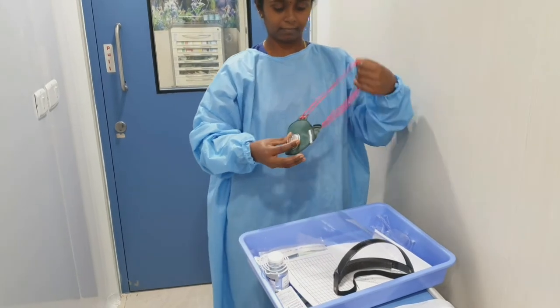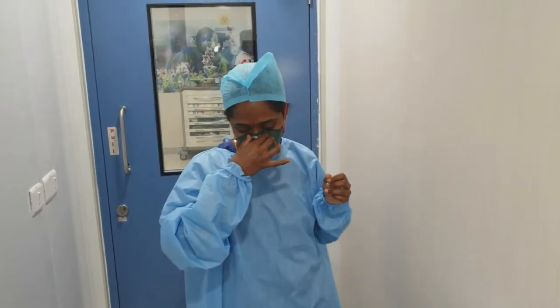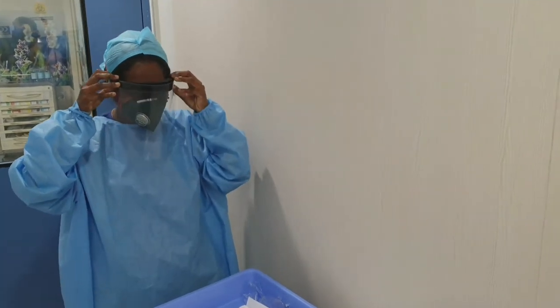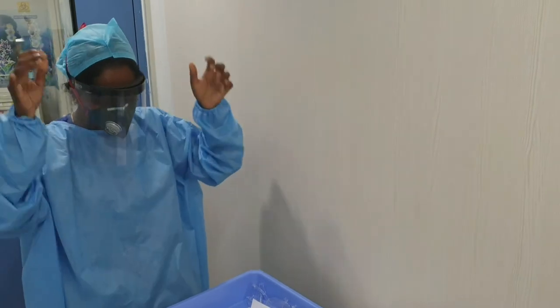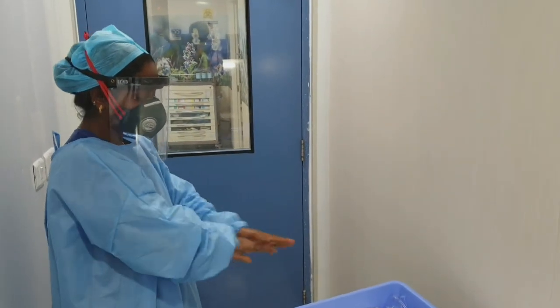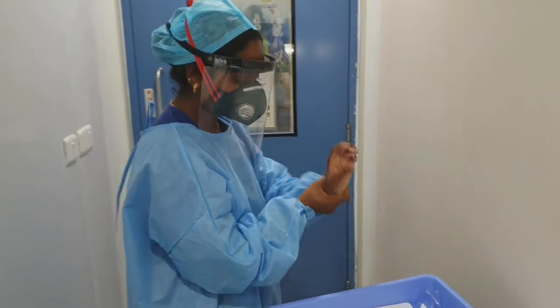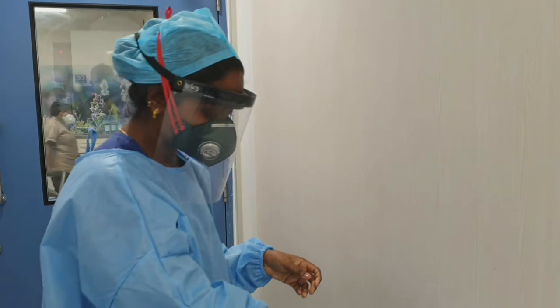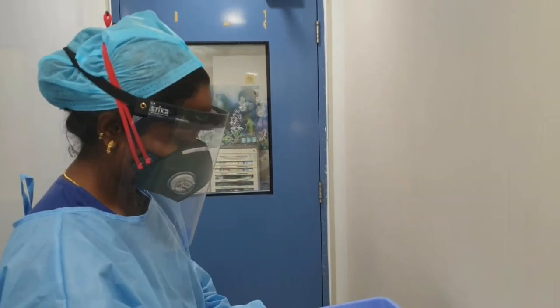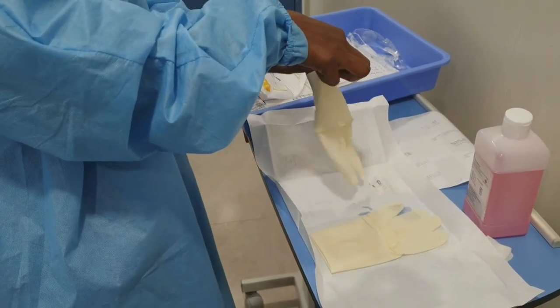This is an N95 respirator mask which is protecting any smaller aerosols from entering into the nostrils. This is an eye shield which helps protecting our face from any spillage of the hazardous drug or chemotherapy. Sterilizing your hand after finishing wearing your PPE. The alternate for eye shield is goggles, which could also be used when an eye shield is not available. She is wearing the first pair of gloves — there will be two pairs of sterile gloves used, with sterile hand gloving technique.